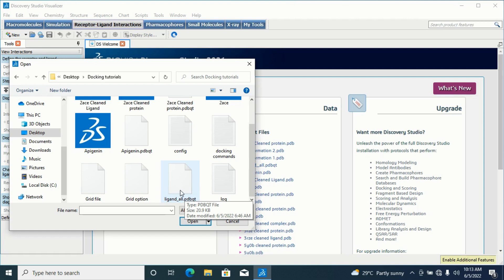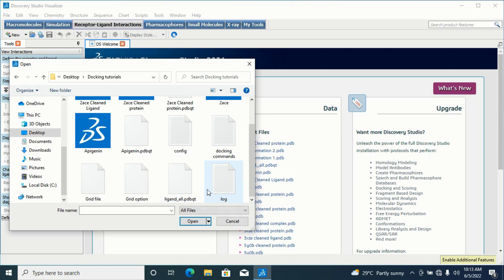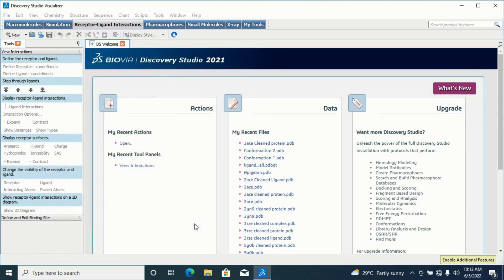It appeared in PDBQT because I saved it as such in my config file in our previous videos. Your result will always appear in PDBQT format after molecular docking because I used AutoDock Vina. AutoDock Vina will generate a result in PDBQT format. So I will simply click on it and open it.